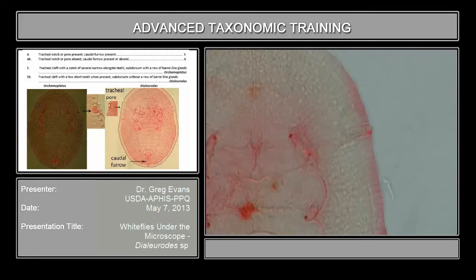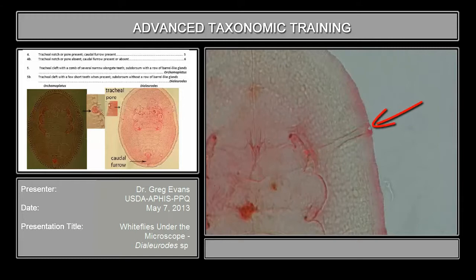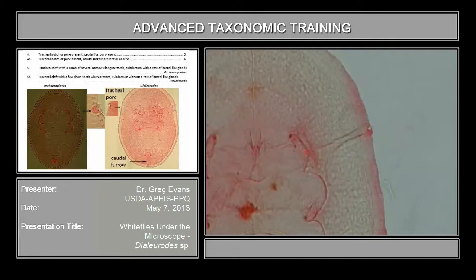At the end of the tracheal furrow you find this pore, sort of semicircular, and it may be filled with very short teeth, but nothing like Orchamoplatus.